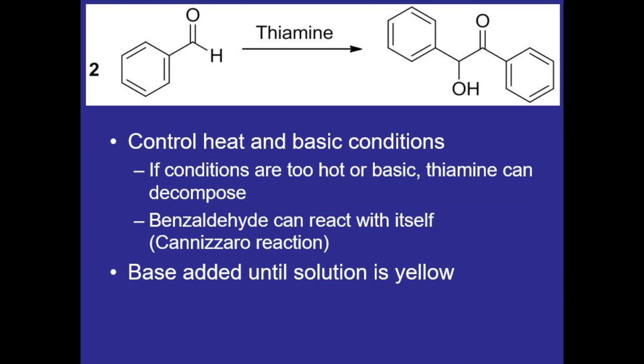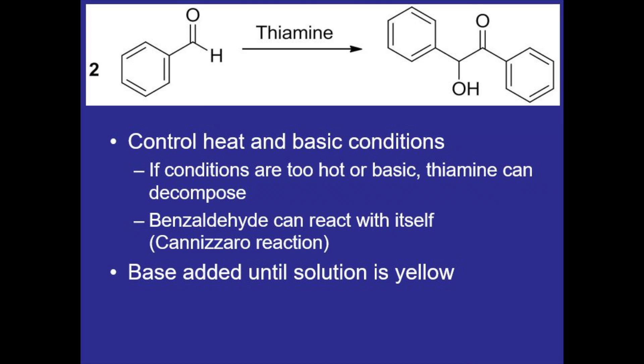So we'll add the base dropwise slowly until the solution turns yellow and that's because thiamine hydrochloride is a salt and it's colorless but as it interacts with sodium hydroxide it turns a bright yellow color and so we'll just add the base up until that point.